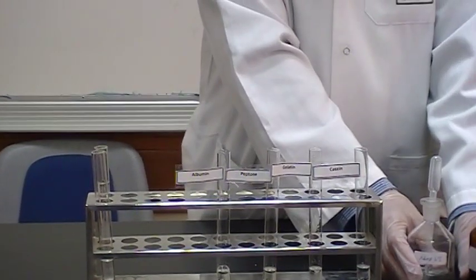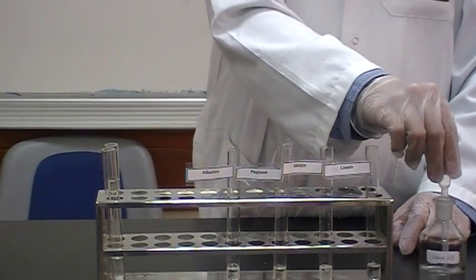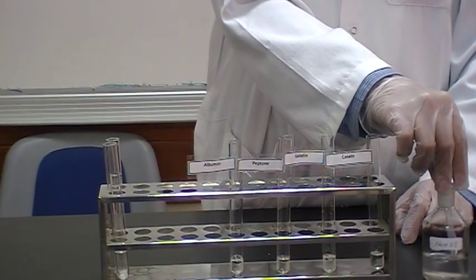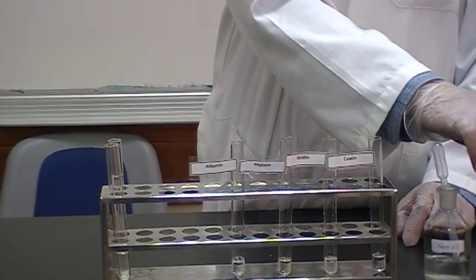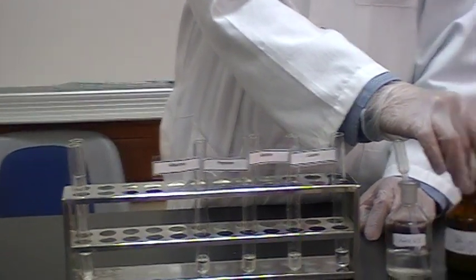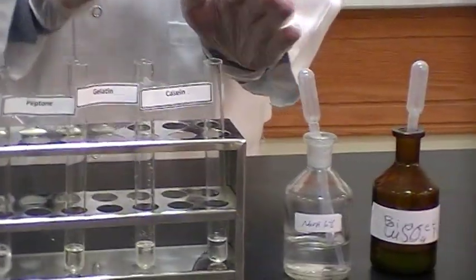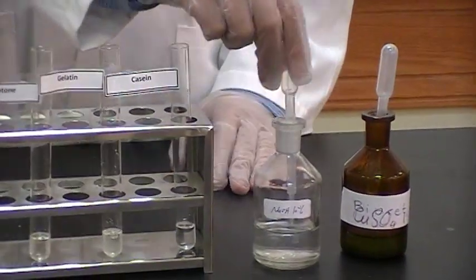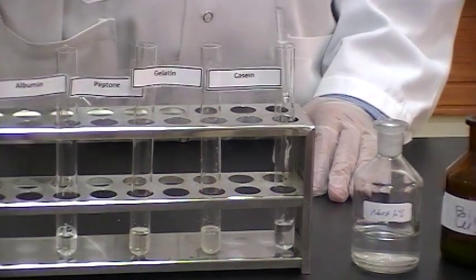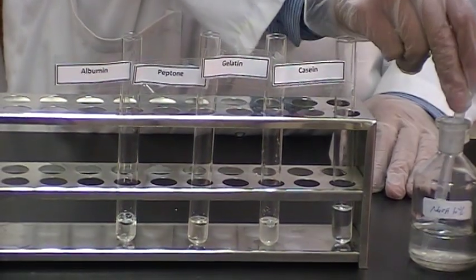First, our reagents, which is, first one is 10% sodium hydroxide, and here we have 1% copper sulfate. The order of them is so important. You could add first, around 1 ml of sodium hydroxide to each test tube.